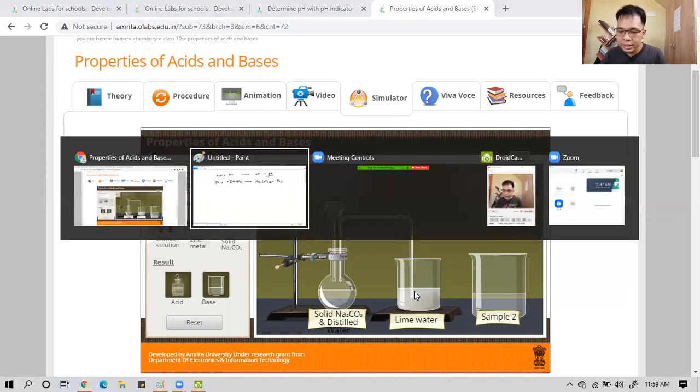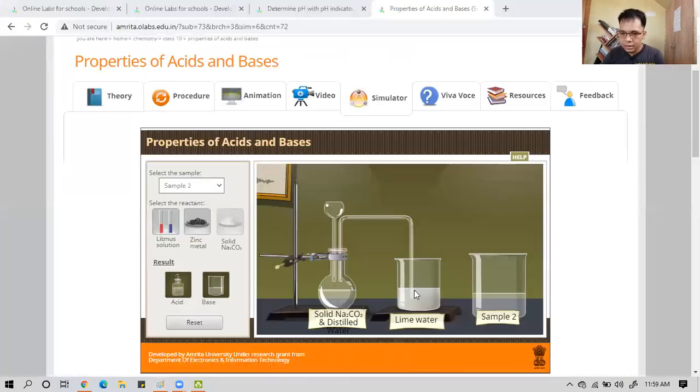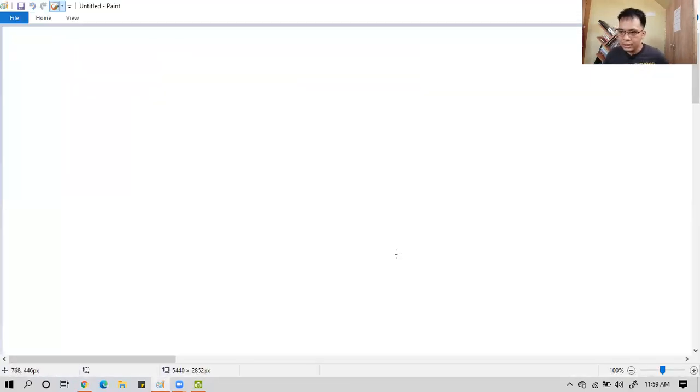So, what is our lime water? The reaction that happened here: let's suppose that our sample 2 is HCl or any acid.